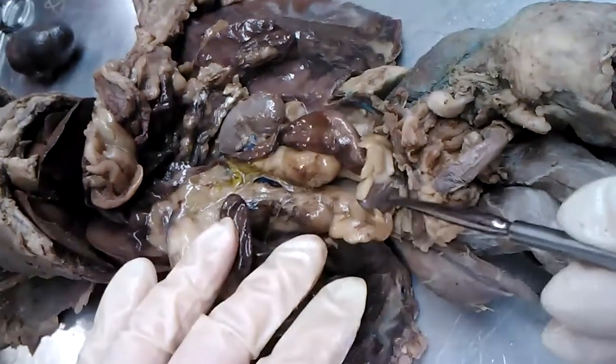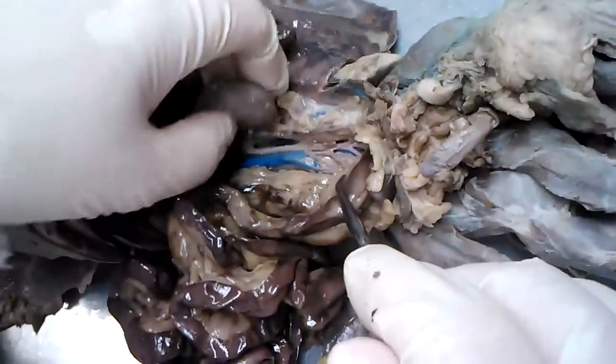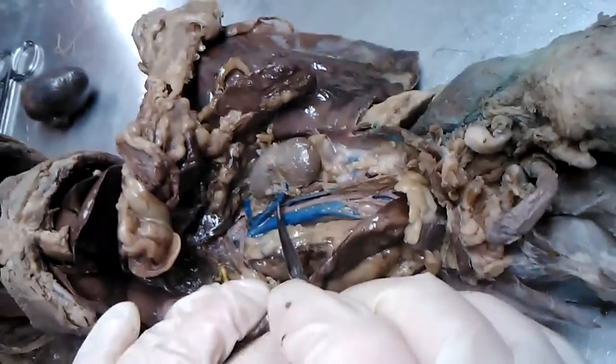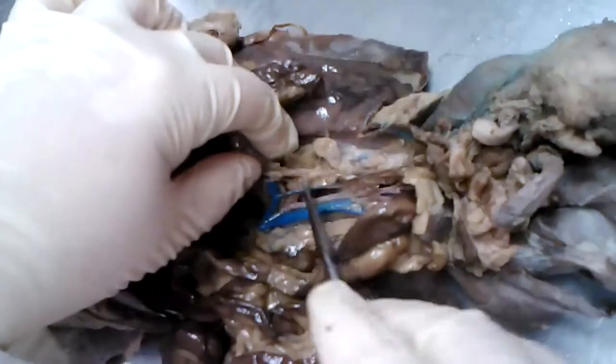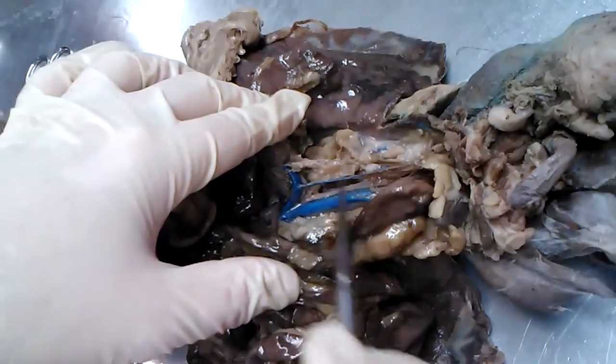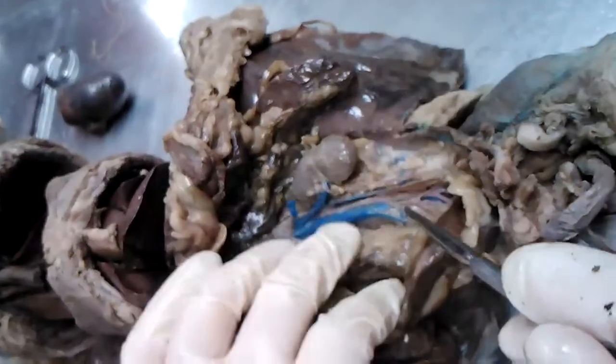Of course, right in front of the large intestine, that was the urinary bladder right in here. Then over here, we can see some other structures. Nice kidney. This would be a left kidney. And this tube here that drains urine from the kidney, this is the ureter. So the ureter would go from the kidney all the way down to the urinary bladder. So that's the ureter.